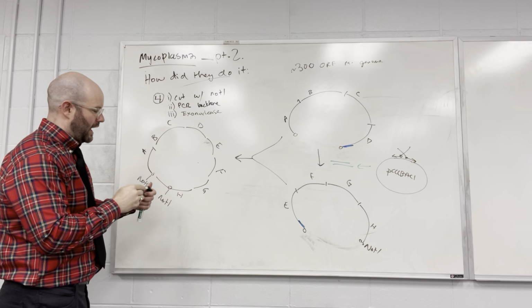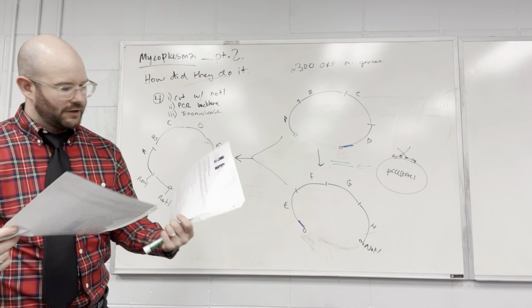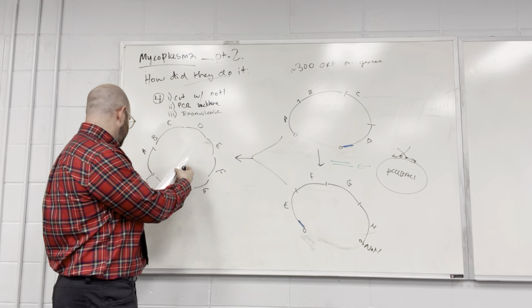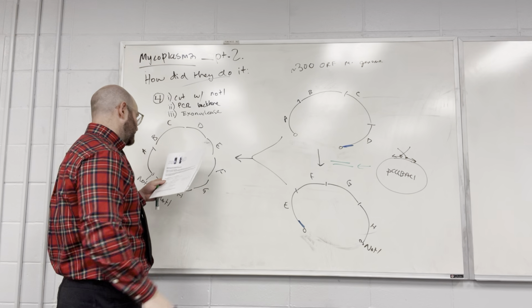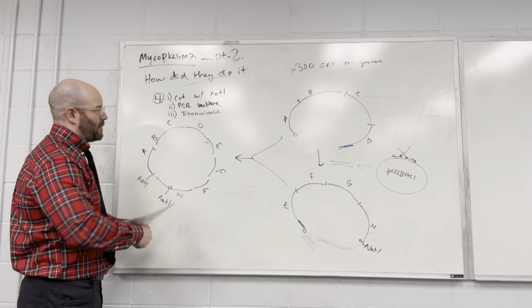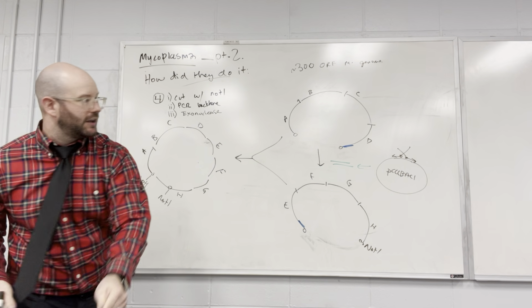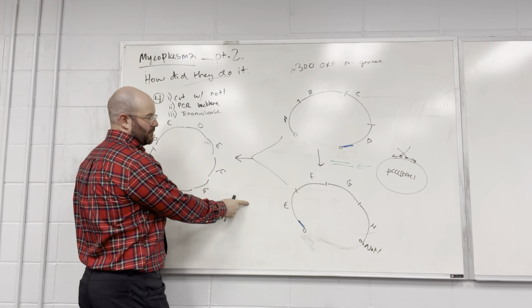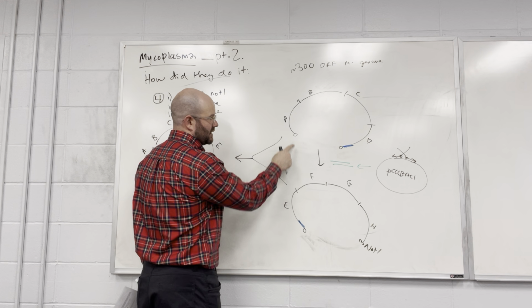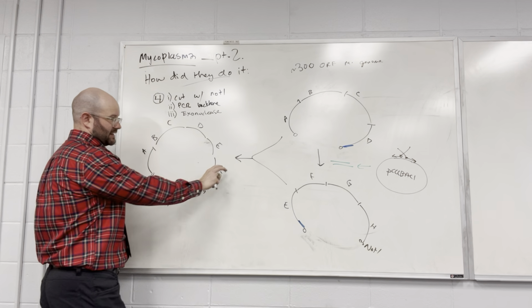Okay? And if you look at, where is it, figure 5. So look at figure 5. This is kind of magical, I don't know why this happened, but the interesting thing about the next process is the NotI sites get removed in the next synthesis.